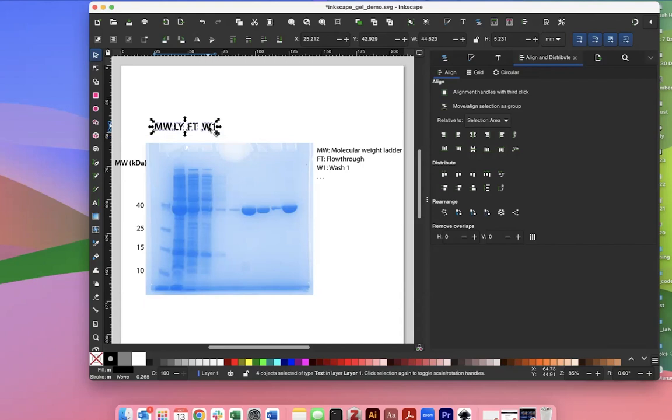And let's just drag them down again. Maybe I want to distribute their centers. Or maybe I just want to distribute their left ends. Nah. Their right ends. Nah. What's the best way to space these out? Maybe just a little space in between like that, even the spacing.